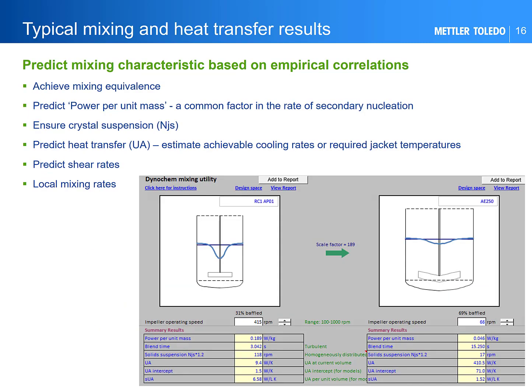The final example shows typical results from using the toolbox on a crystallization process, looking at both mixing and heat transfer. There are a lot of things to consider when scaling up a crystallization — from the heating and cooling to the mixing, which impacts solid suspension and nucleation rates. The toolbox allows a quick computation of the comparison of vessels when going from lab to plant. Note it's not possible in general to keep all the mixing parameters the same on scale, so you have to decide which are the key ones for your process.